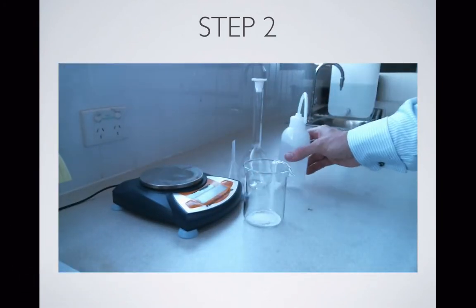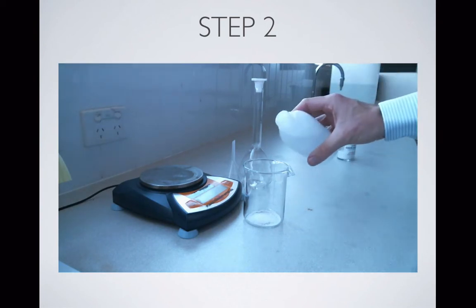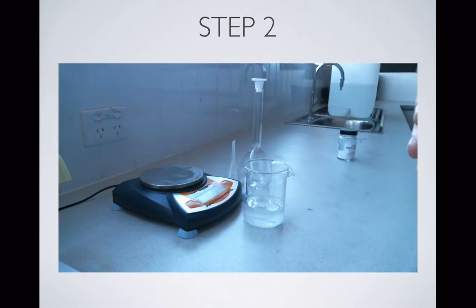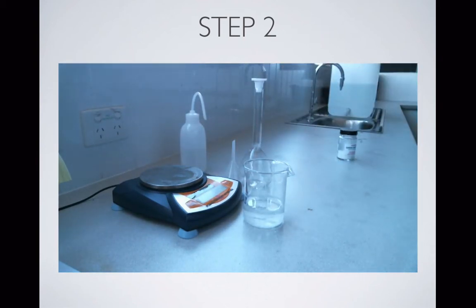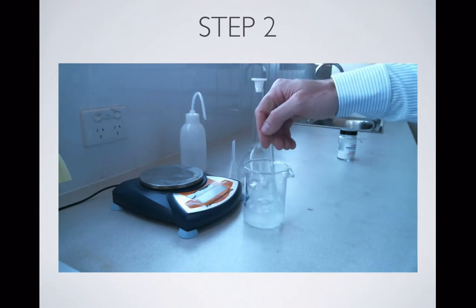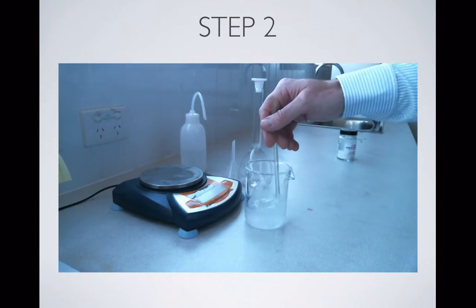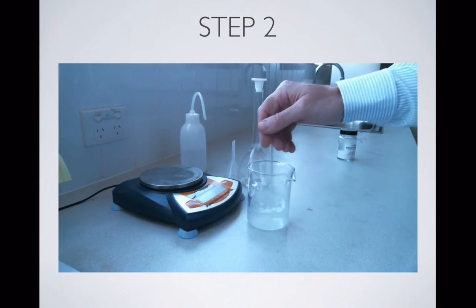Now, I just need to be a little bit careful here when I dissolve the substance in water, partly because I don't want to splash the solution around, because that will end up causing me to lose some of my substance, but also because I need to be aware that my volumetric flask is only going to hold 250 mls. I'm going to need to rinse this beaker in a moment, so I need to try and dissolve the substance in quite a lot less than 250 mls of water, so that all the solution that I make and all the rinsings are going to fit in my volumetric flask at the end of this.